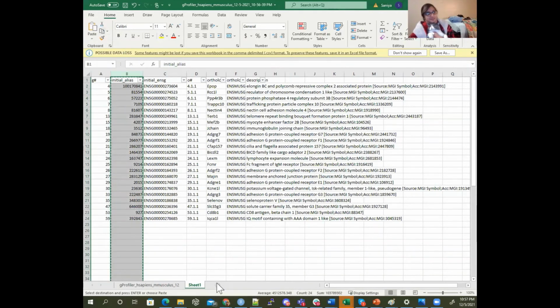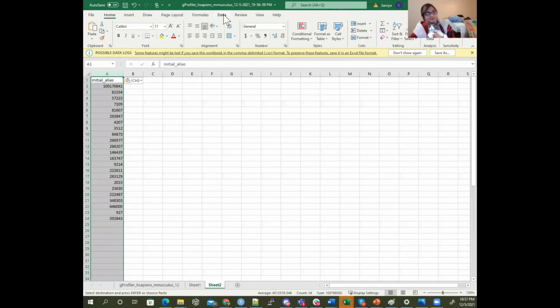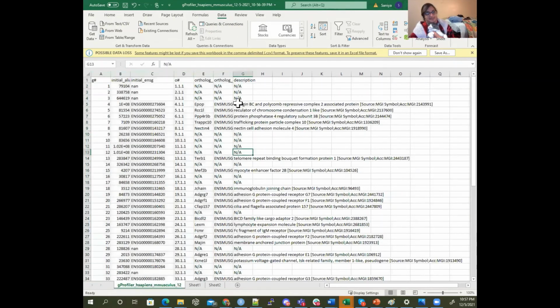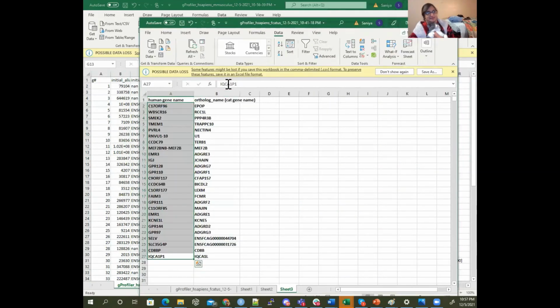So it seems like there was a bit less overlap here for the humans and mice, the 24. So that means that there was a little bit more similarity here. So the 23 of them mapped between humans and mice instead. And I think that there were 26 that mapped between the human and the cat.